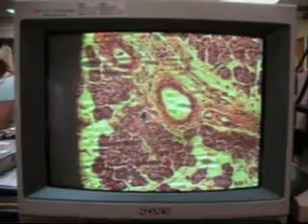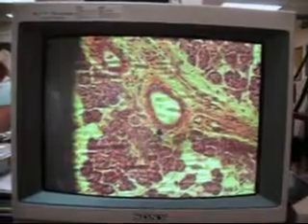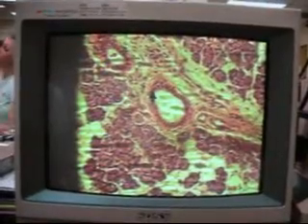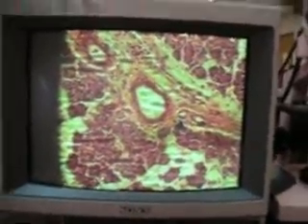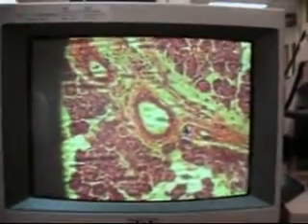Okay, so there are lots and lots of ducts around here, and so see, this is another duct. You see this one, and so this is not an artery. You have to look at the cell, look for endothelial cells, and make sure that you're looking at the cell type that's there. Now, there's probably an arteriole right here. Look right there. You can see how that's located. You can see essentially two smooth muscle cells around that, and that's a small arteriole. Okay, and so you have to go in and look around like this.